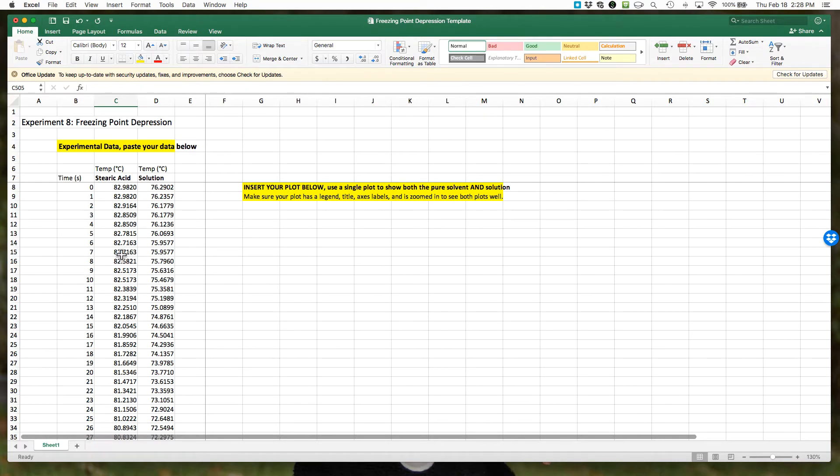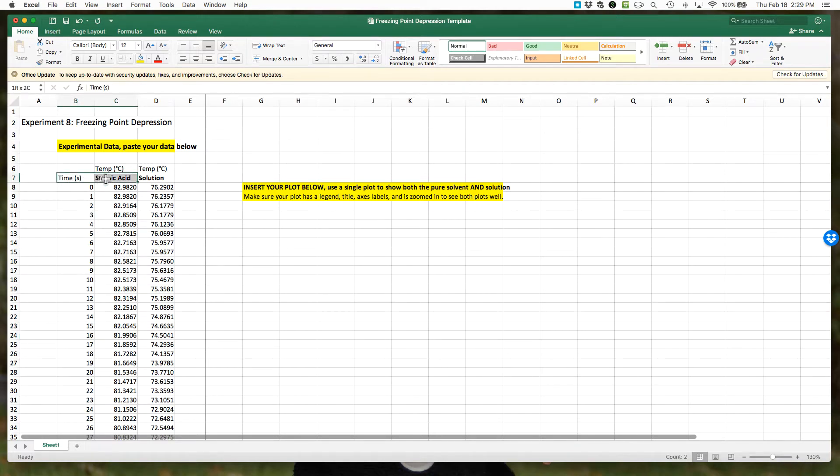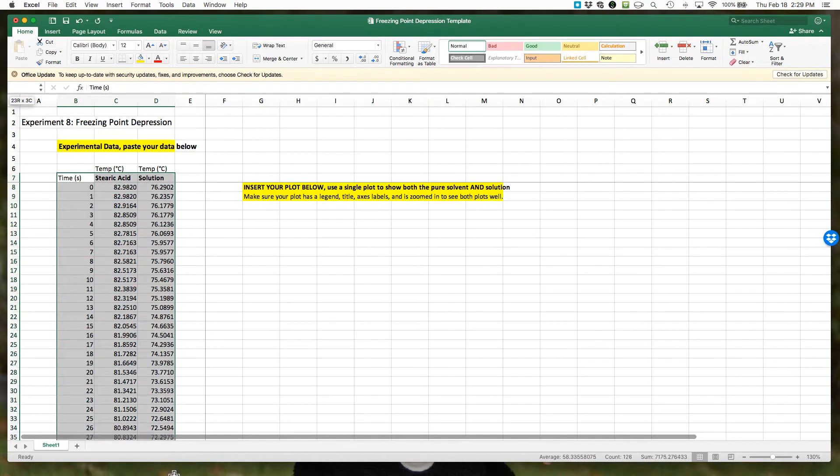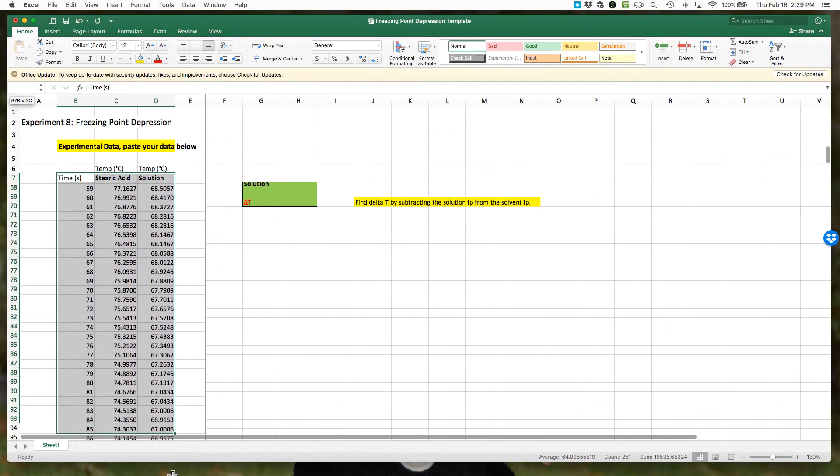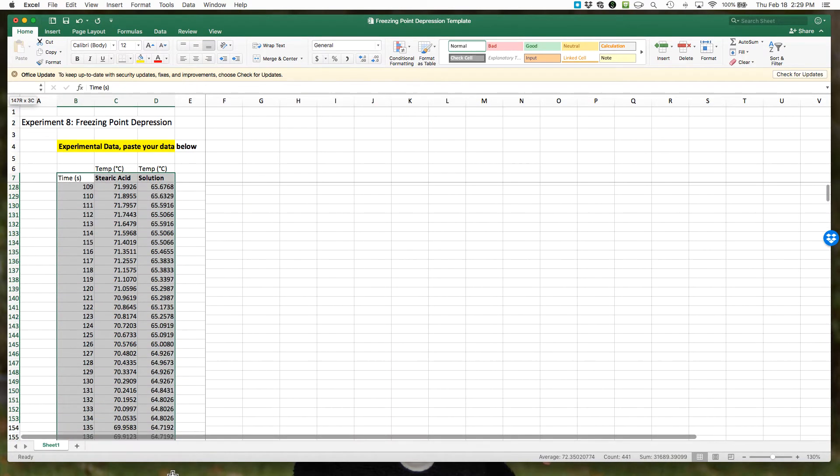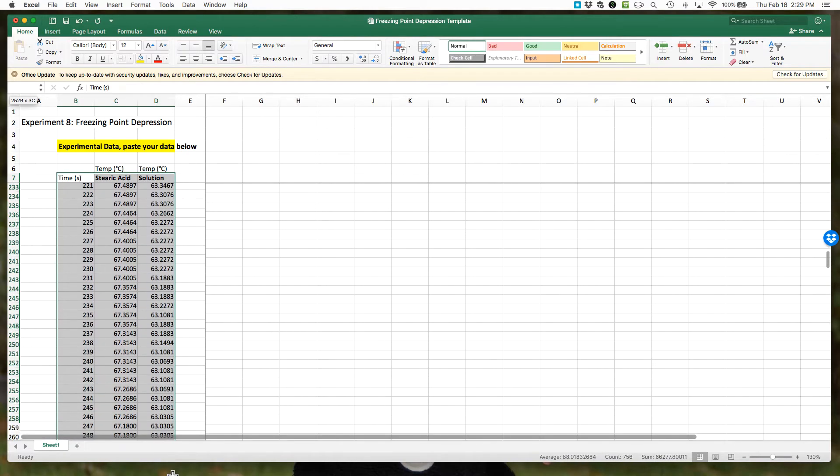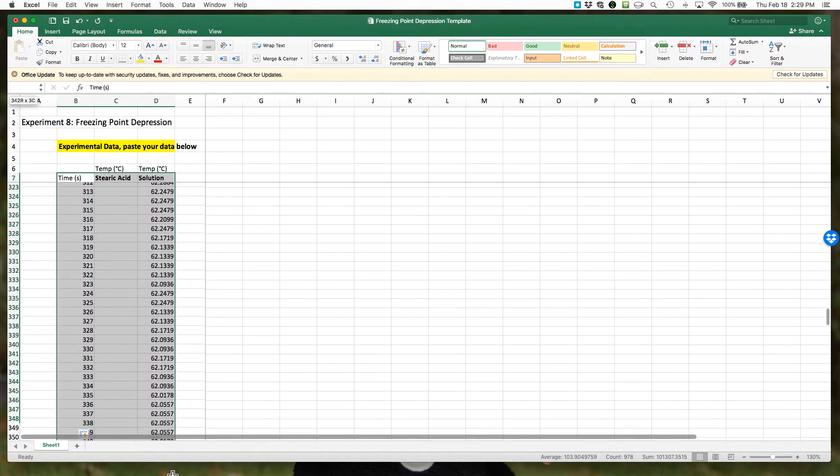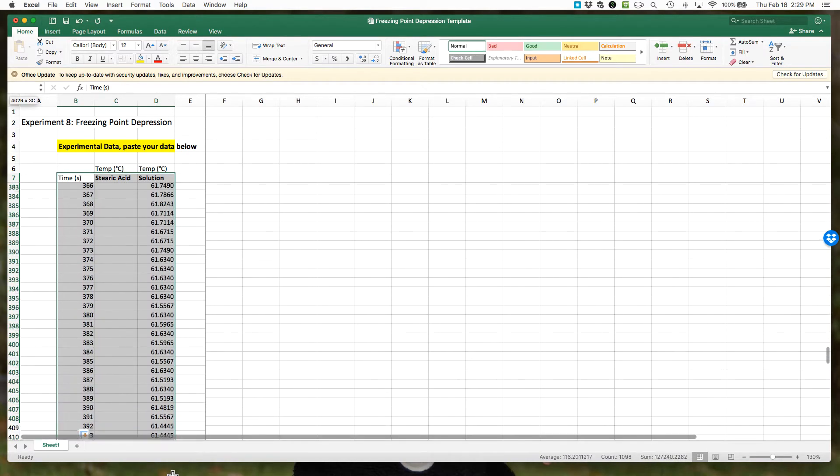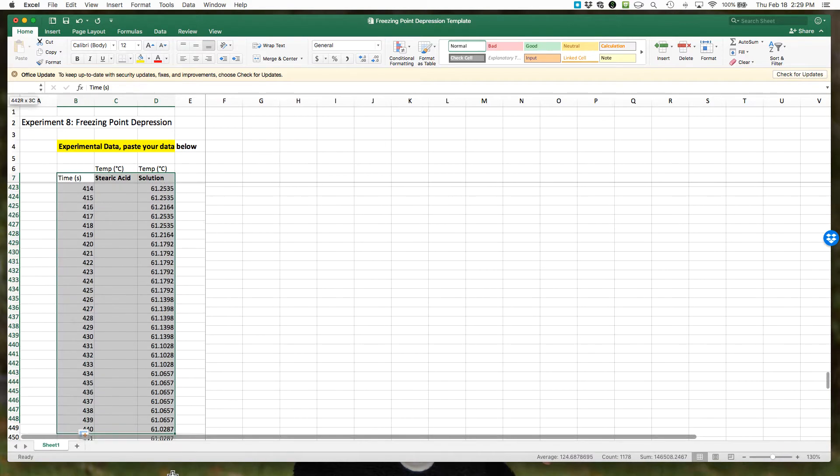Next, what we need to do is make our plot. To make our plot, I'm going to highlight the cells we want. I'm going to start highlighting with our column headings: time, steric acid, and solution. I'm going to drag all the way down to the end of the data, and I'll get to the very end.